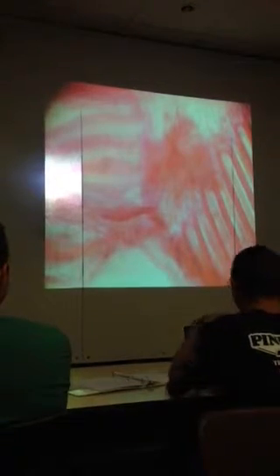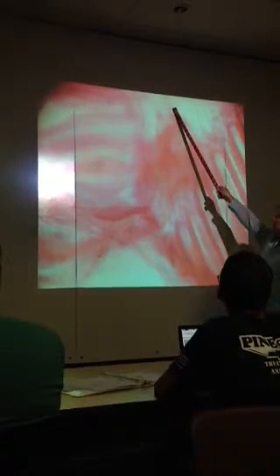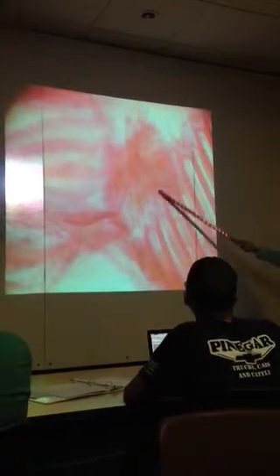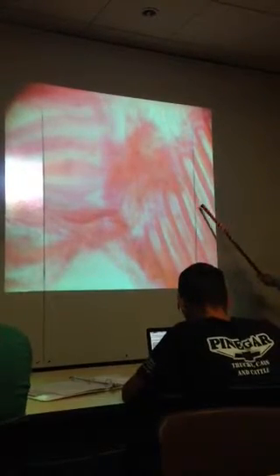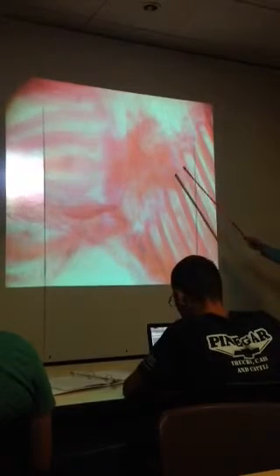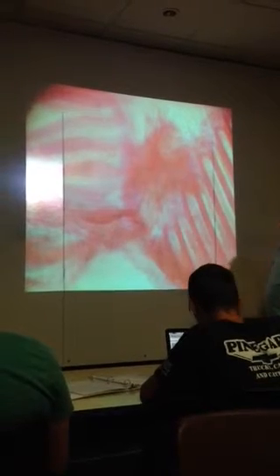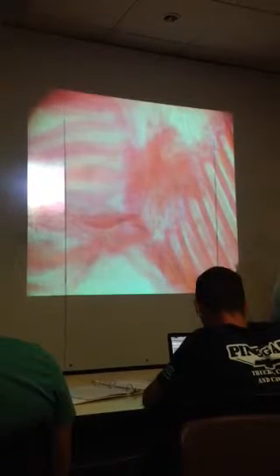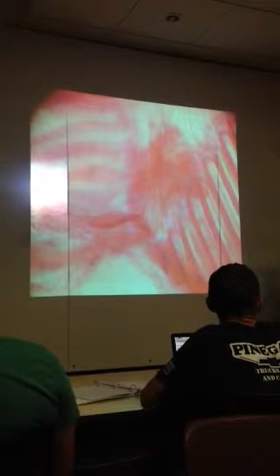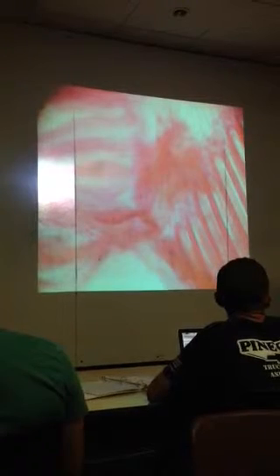All right, now we're getting to the area of the velum. This is the velum coming down here, and then here is the peripharyngeal band coming in at an angle. These are your gill bars, and these are your gill slits in between. I was trying to get velar tentacles, but it's too blurry. I can't really make them out. Again, if I can't get good, solid, clear-cut pictures for the test, I will use the drawings. That's when the drawings come in.